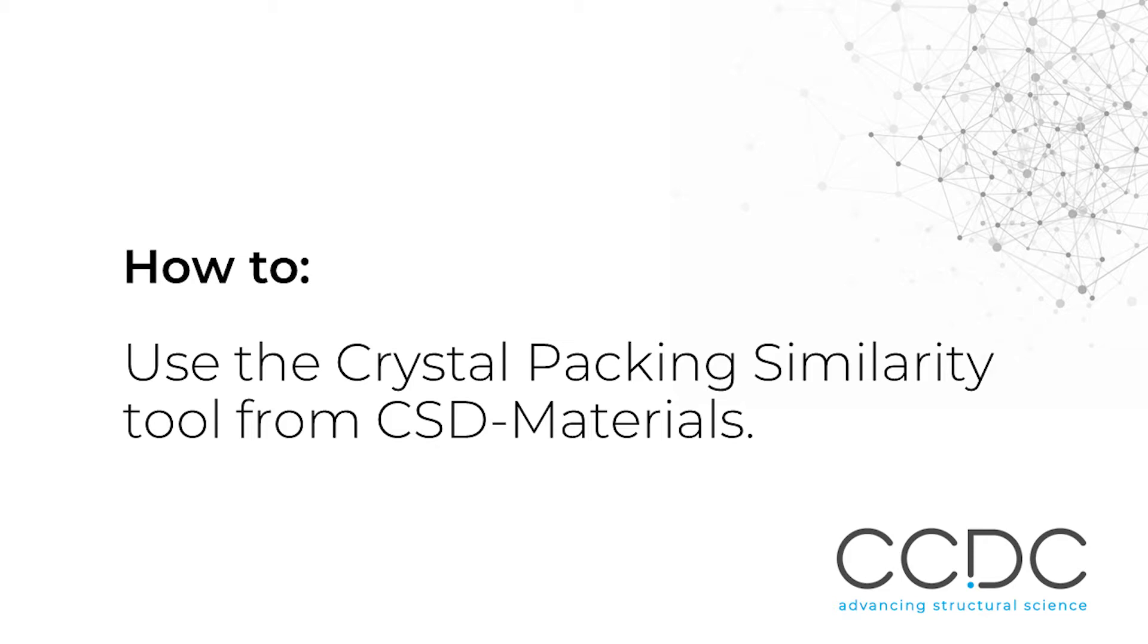Hi, this is Matthew Stout from the CCDC. Today I would like to show you how to use the Crystal Packing Similarity Tool under CSD materials. Let's get started.